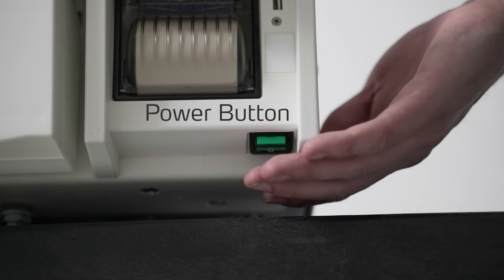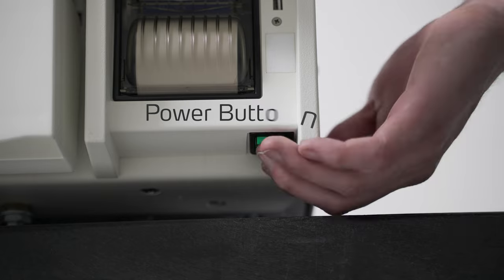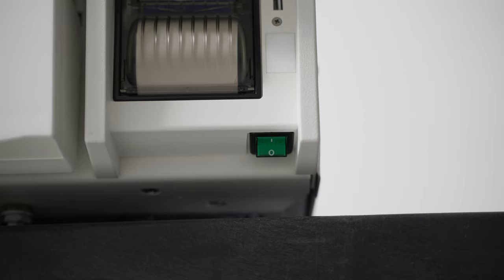Down here at the bottom of the panel we have the power switch. When you want to begin your operations for the day, begin by flipping it forward, and to turn it off at the end of the day, back for off.